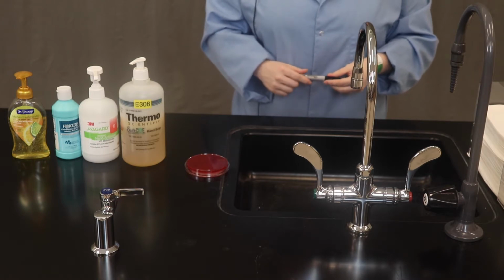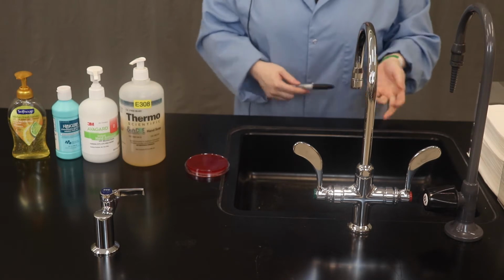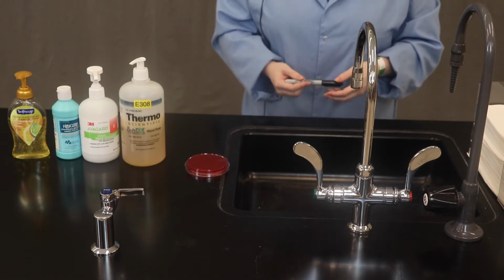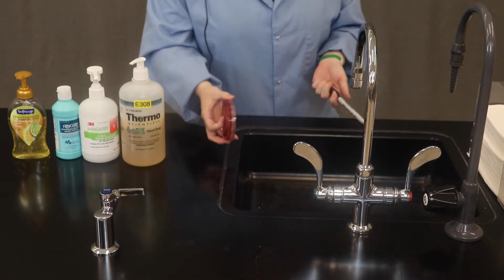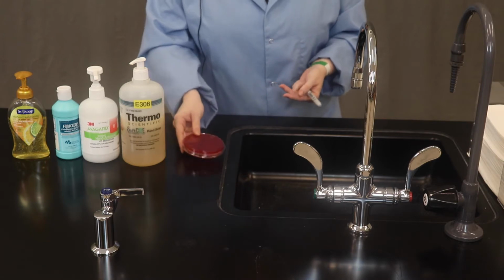In this video demo, I'm going to show you how we would perform the hand washing experiment if you were to take this in person with us. For this particular experiment, hand washing, we're going to work here in this example with a blood agar plate, or a BAP plate for short.